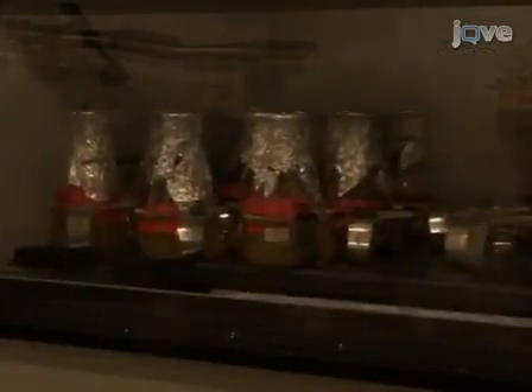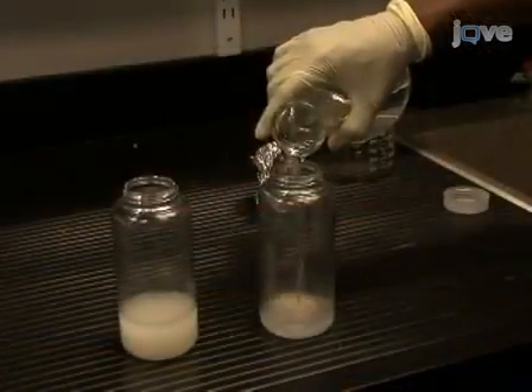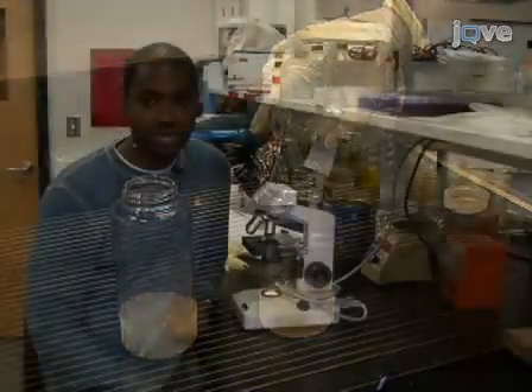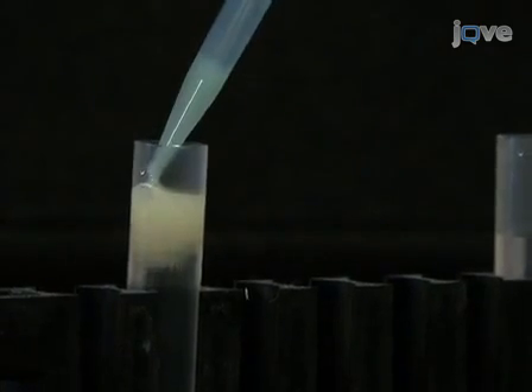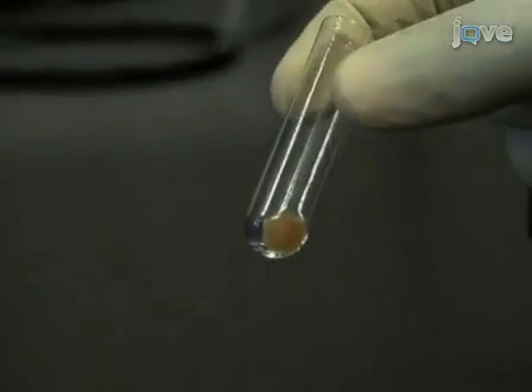Hi, I'm Dr. Christopher Gregg from the lab of Dr. Vladimir Titorenko in the biology department at Concordia University. Today I'm going to show you how to isolate mitochondria from the yeast Saccharomyces cerevisiae. We do this to study the dynamics and the age-related changes that take place in the mitochondria as the cells age. We're going to look at changes in the proteome, lipidome, and the DNA of the mitochondria.